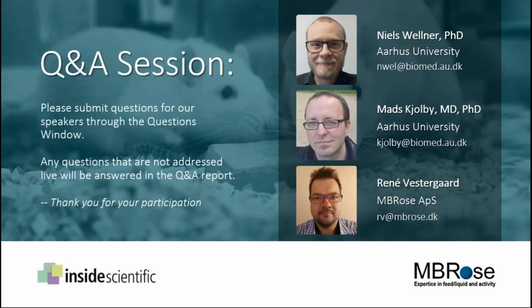Okay. Renee, do you have anything to add to that, based on your experience? Yeah, I agree with Mads. It's very specific for each country as well regarding legislation. So it depends on the strain, the genotype, the legislation, and also the experience of using the system. But I totally agree with Mads on this. Okay.